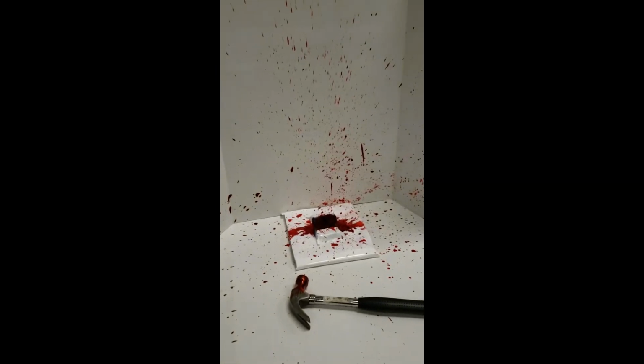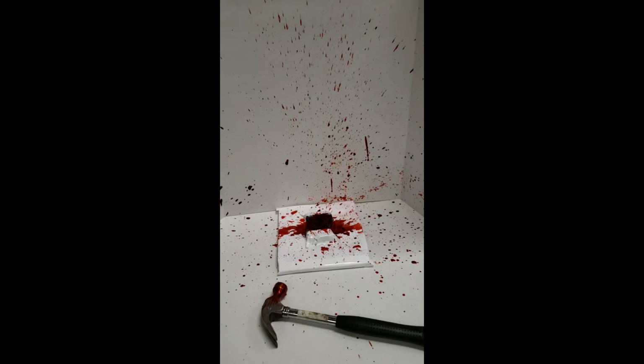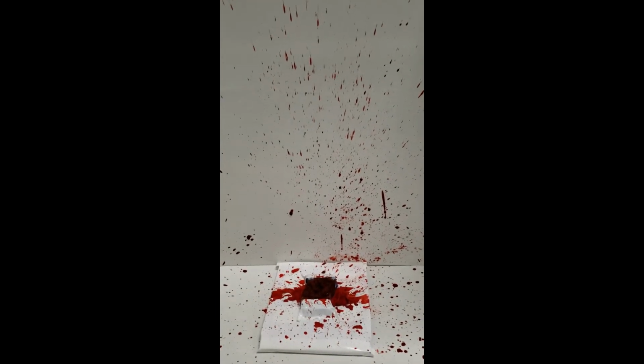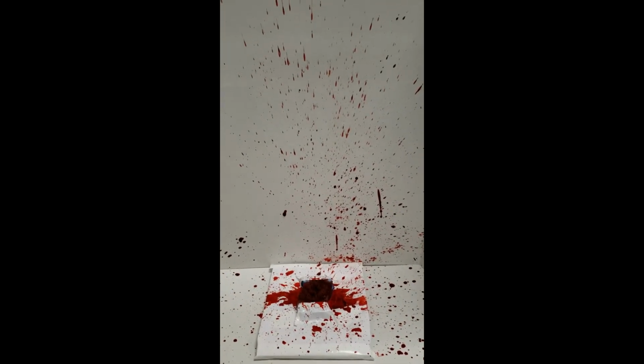The reason I'm dressed up like this today in a poncho and goggles is because today's topic is actually blood spatter analysis. Now, blood spatter has become popular from a lot of TV shows like Dexter and so forth. And today what we've done is applied fake blood to a sponge here, which I've then struck with a hammer several times to create this pattern of blood spatter on these pieces of cardboard. And what we'll be doing later on in class today is taking measurements of this pattern and using it to figure out the point of origin of the blood.